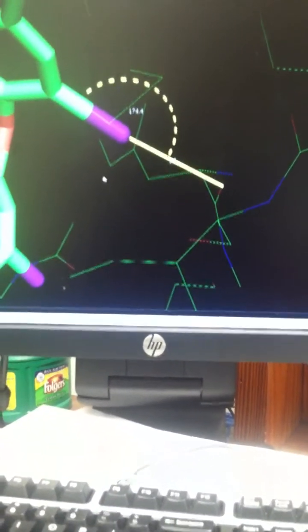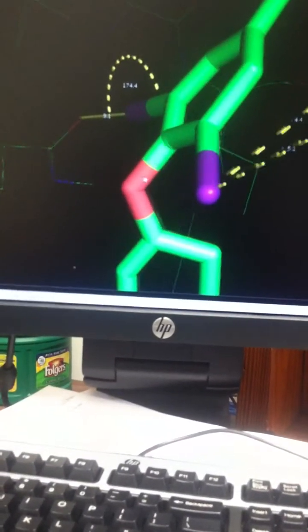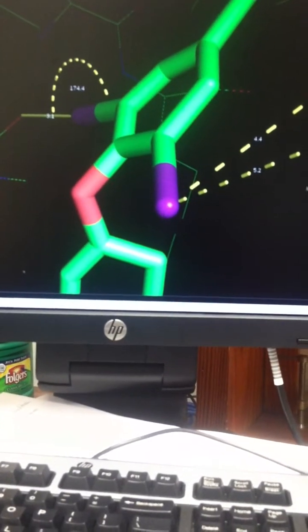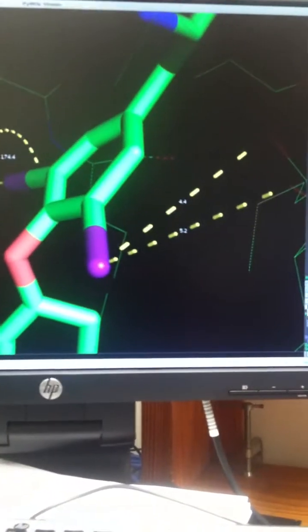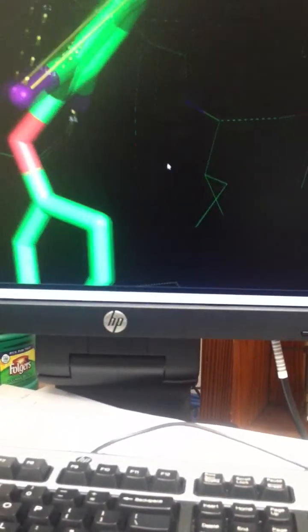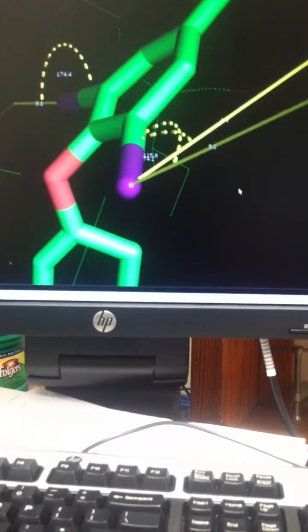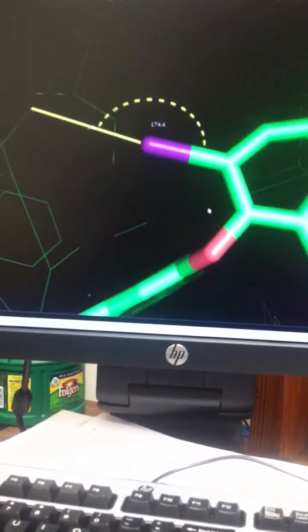This was probably the best one I could show you, and those were probably some of the worst ones I could show you. I'll even show you the angle. You can tell if you look from this, that looks like a 90-degree angle. So it's not what we're looking for, but let me show you anyways. 1, 2, 3. See? 74. Not what we want. 1, 2, 3. 115. Still not really what we're looking for. We're looking more for these.